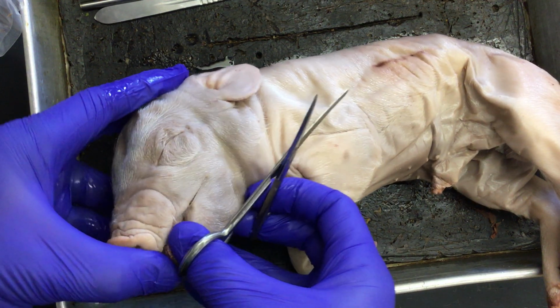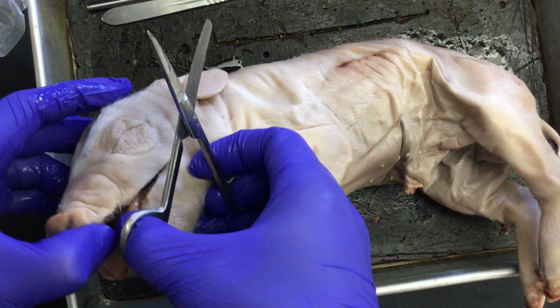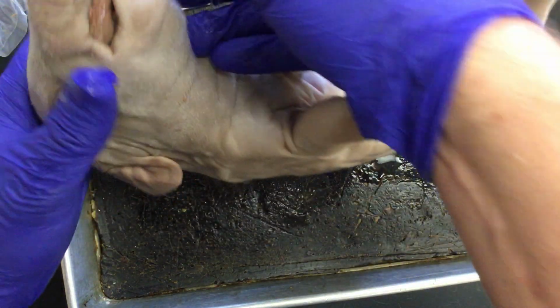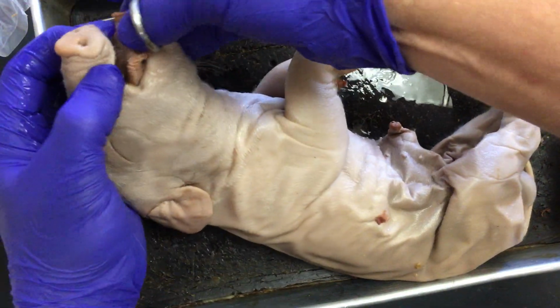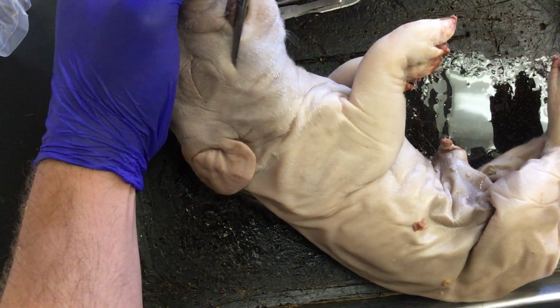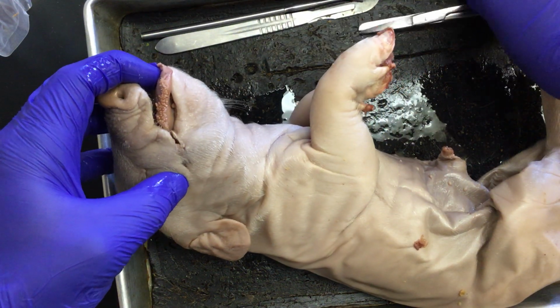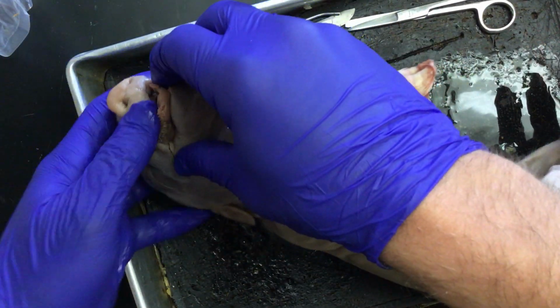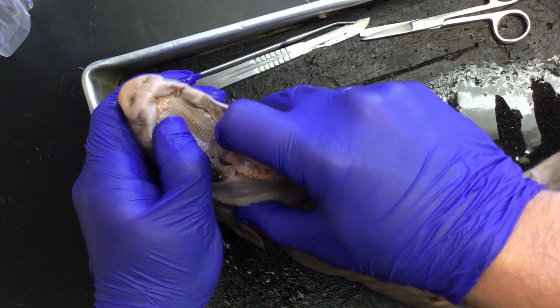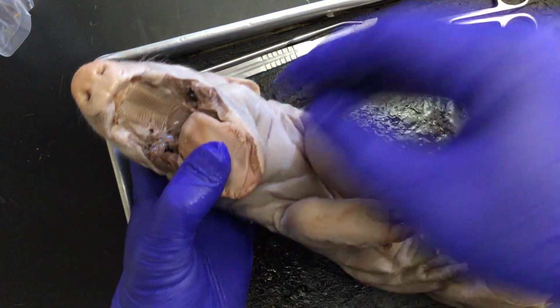I'm going to make a couple snips, following the trajectory of the oral cavity so that I don't accidentally cut into tissue that I'm not hoping to cut into. So I'll cut slightly downward and back. Some of that crunching is that I'm not just cutting through tissue, but I am cutting through the pig's jawbone. Alright, so now we're going to get a good look at the inside of our pig.